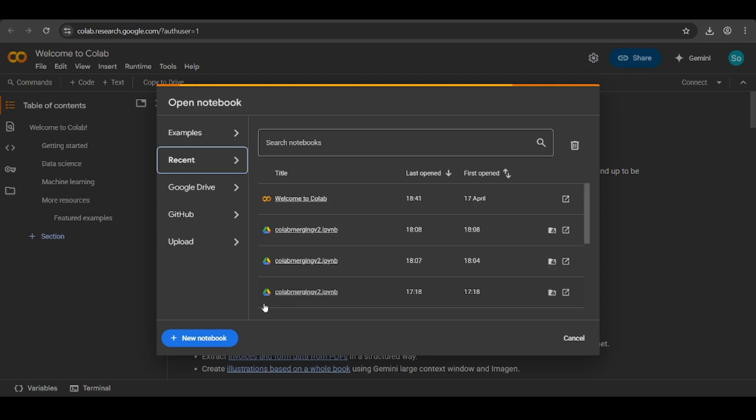This is part two of the tutorial on the playlist. This tutorial will tell you how to take the filtered file that you made in the last video and put it into the AADR, which is a dataset with ancient files that you can run yourself against on Colab with other academic tools.